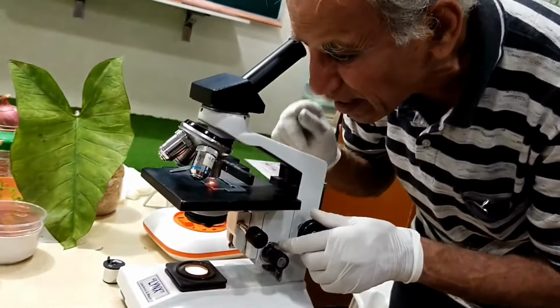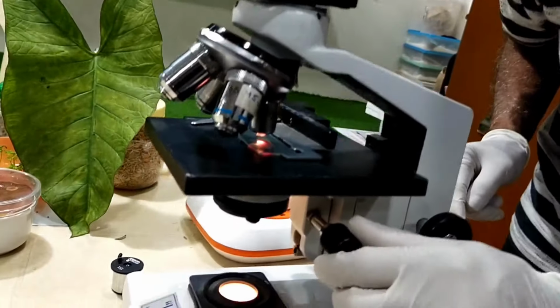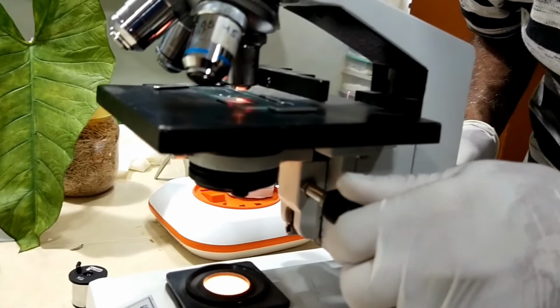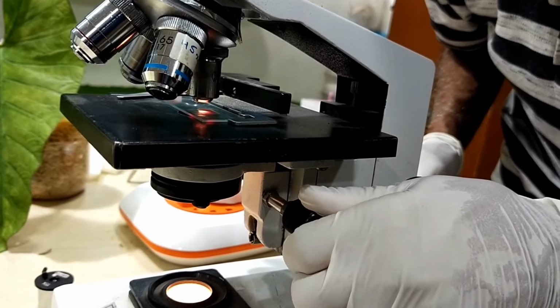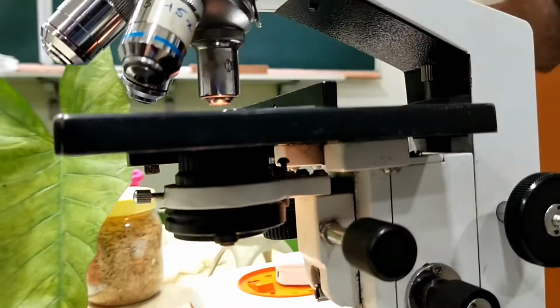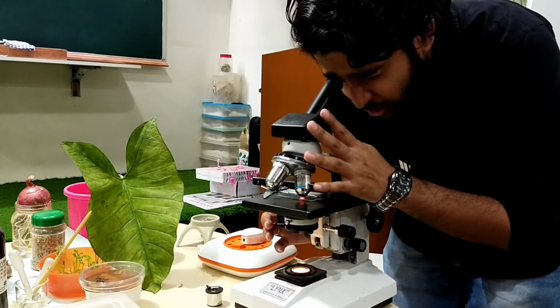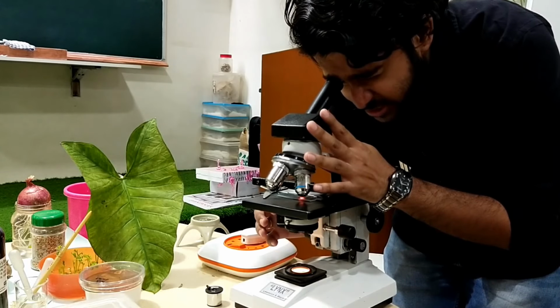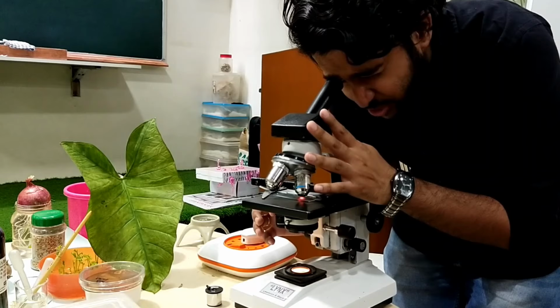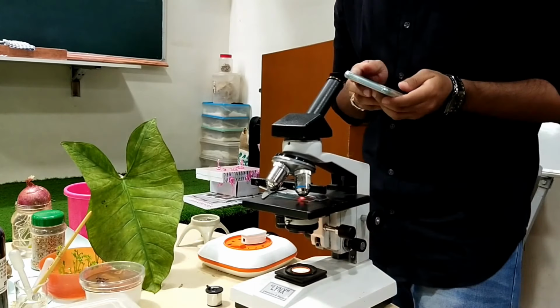Now, Kaustubh sir, can you just take a picture? This is a condenser. I'll adjust the condenser also. Look at this condenser. Yesterday, in the earlier practical also, you have seen the movement of the condenser. So that condenser lens is moving up and down. It's fine. Just take a click, please. So now I'm just looking, and I'll find an area where the cells are not much in density, and yes, I found the spot, and now I'll click a picture and I'll just show it to you.